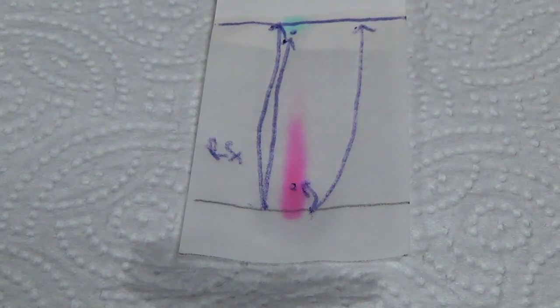There's lots and lots of types of chromatography. Each one uses a different stationary and different mobile phase because of the type of molecules you're separating. Now, before we end, I want to show you one other thing.